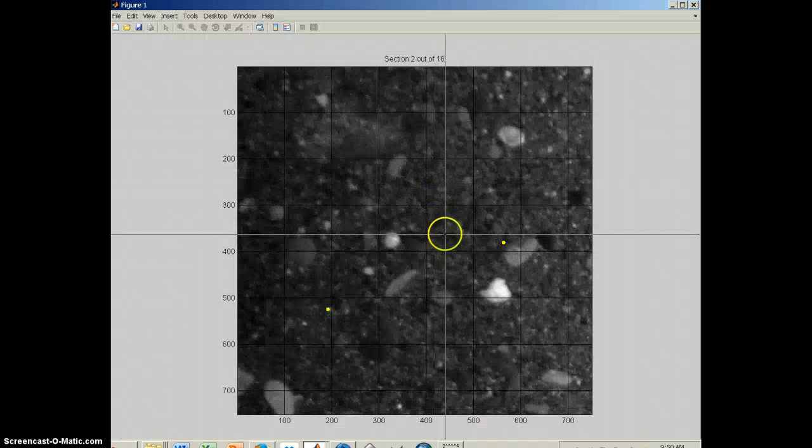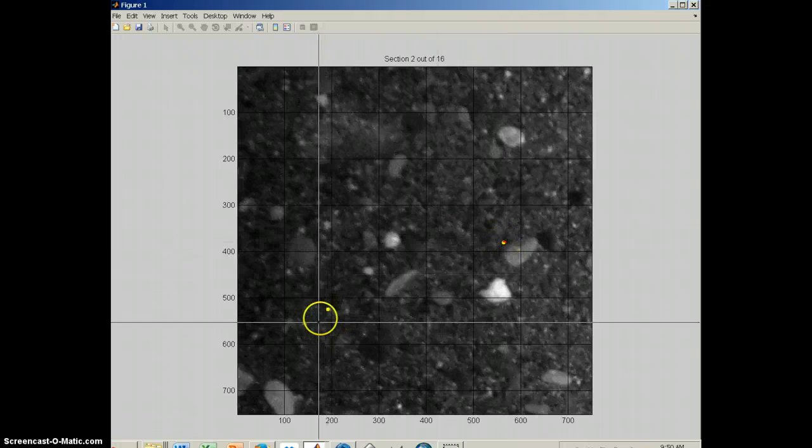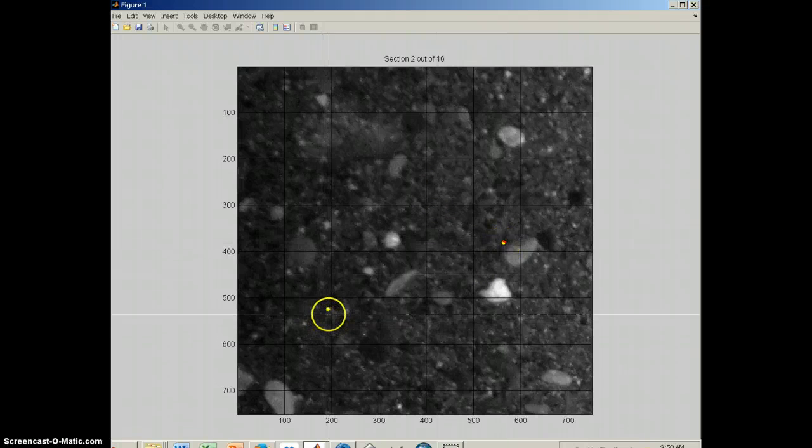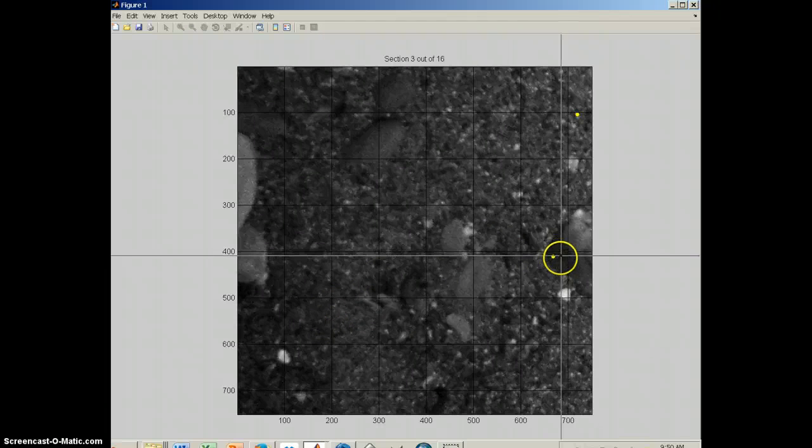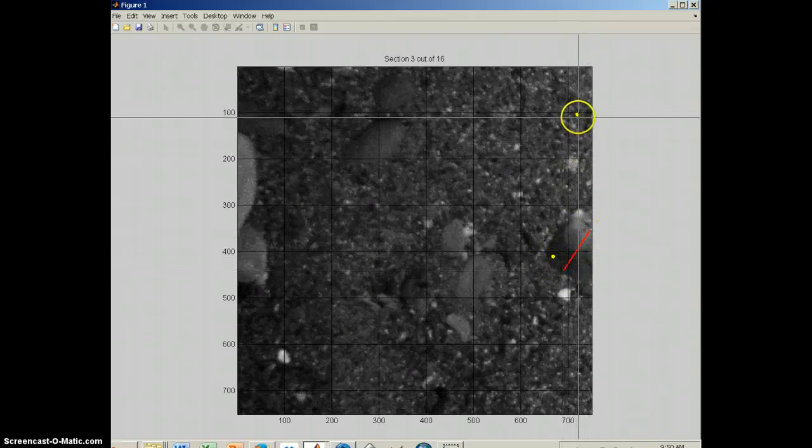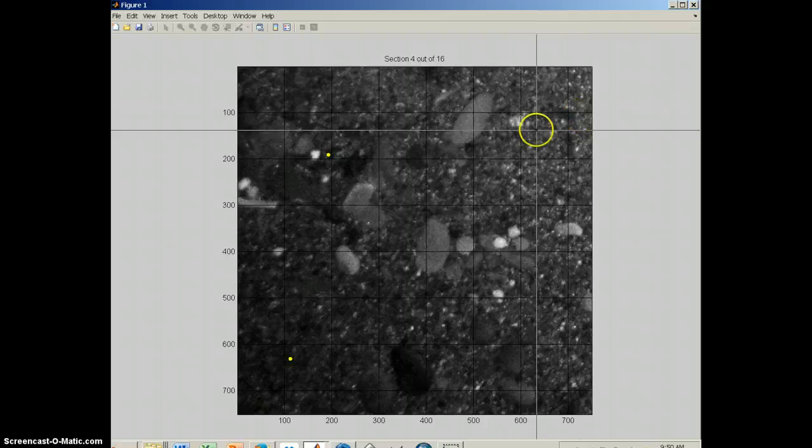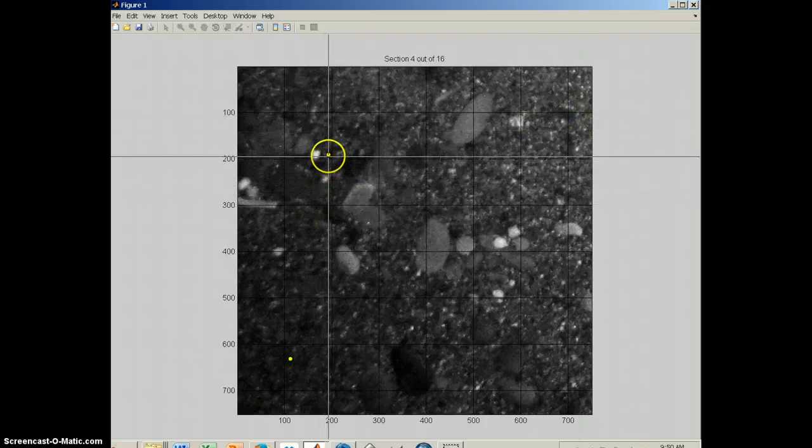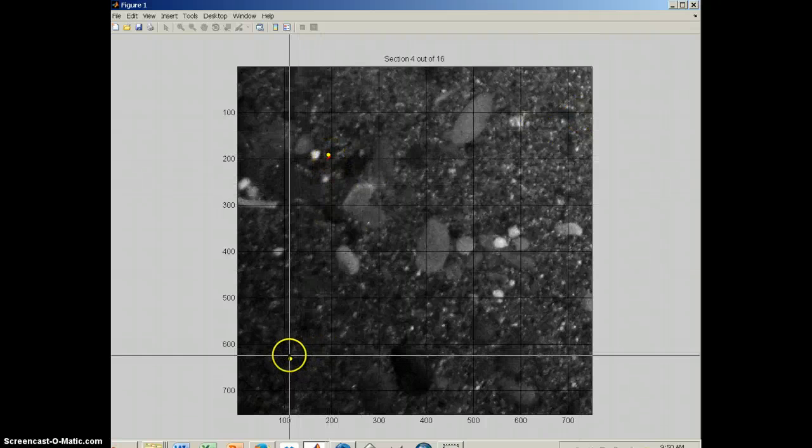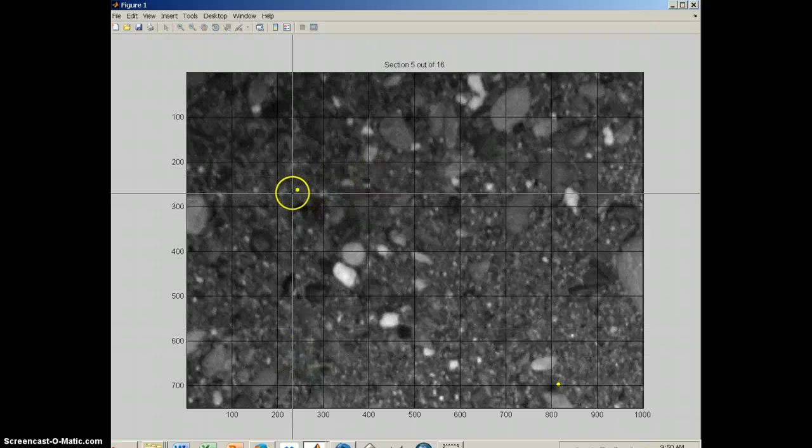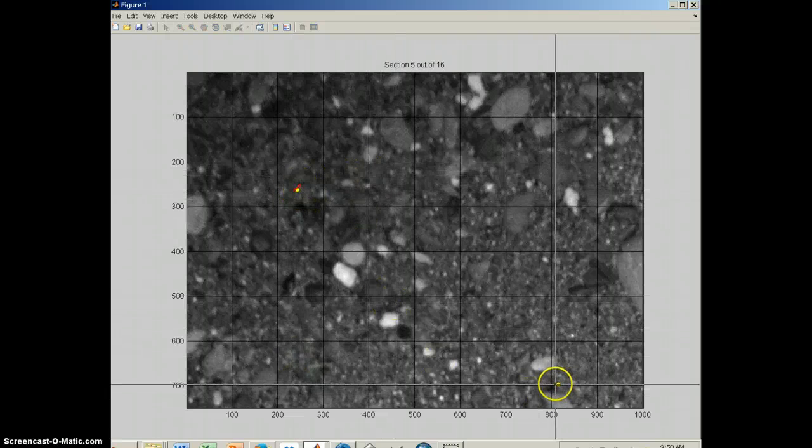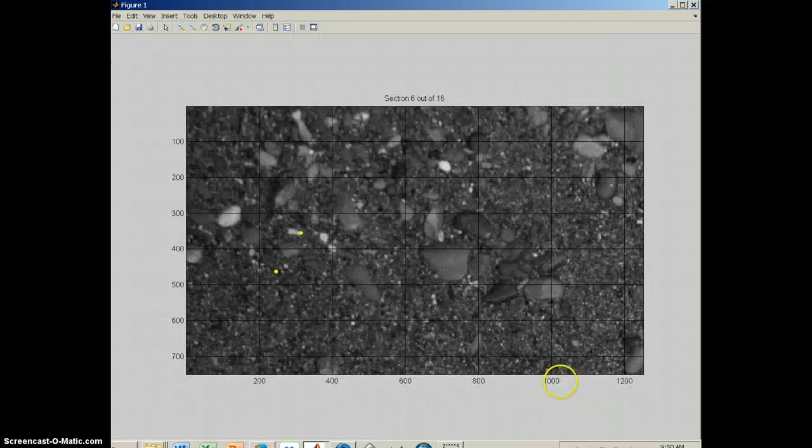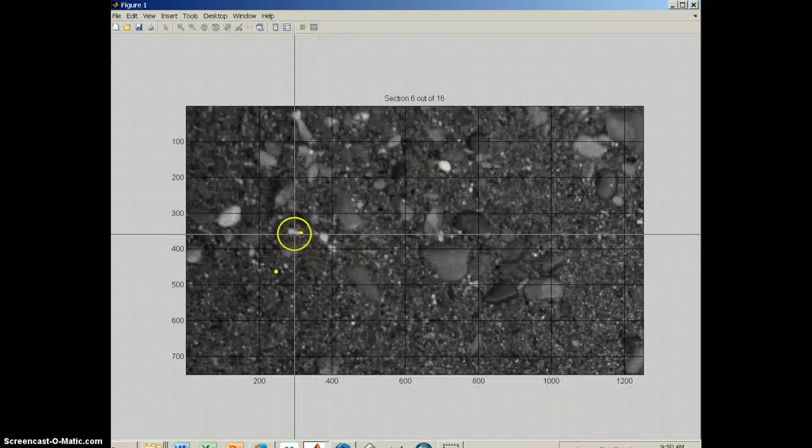And it's going to go through and do the exact same thing again. Here the grains are, in general, quite a bit smaller. This is an exception right here. Sometimes it's hard to see the grains, so you just have to sort of do the best you can, especially for the smaller grained images.